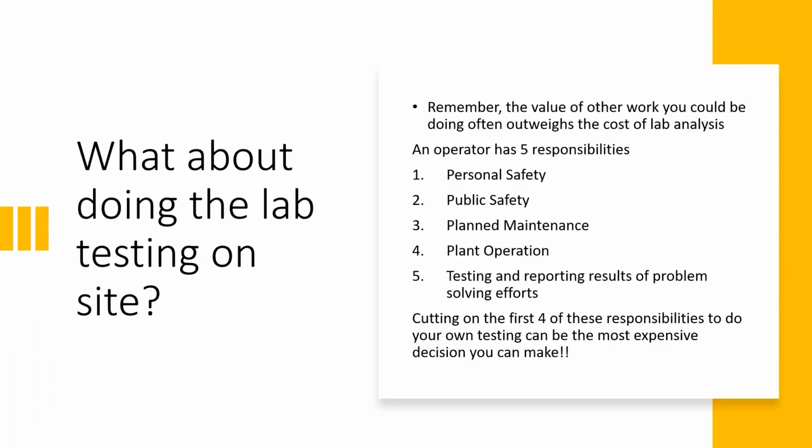But if you cut into those first 4 steps for the 5th one, which is testing and solving problems, your lab test can be the most expensive decision you ever made. And you might not even get good results, besides not having the right equipment to work with. So that's the most important thing to remember from the operator's point of view.